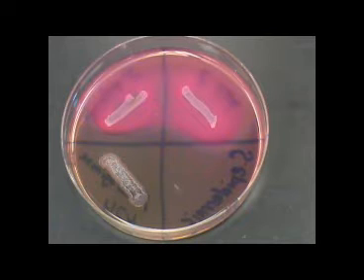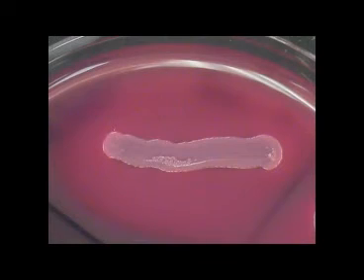Interpretation of results. Again, MacConkey agar differentiates between lactose fermentation and no fermentation. Shown here is a coliform present on MacConkey agar. This coliform here is E. coli. E. coli is capable of lactose fermentation. The fermentation has given off acidic waste products which have diffused through the media, causing neutral red, the pH indicator, to turn a bright pink.